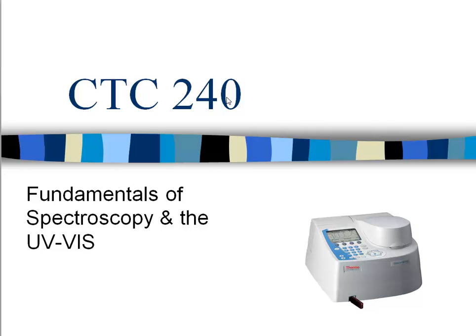The videos will be broken down into three portions. The first portion will be focused on the theory and the background and the math that's associated with UV Vis. The second portion will focus on the instrument pieces and parts. What makes this machine work?